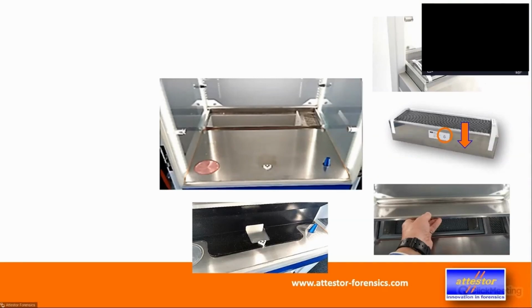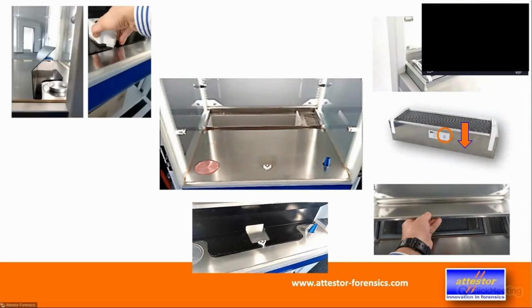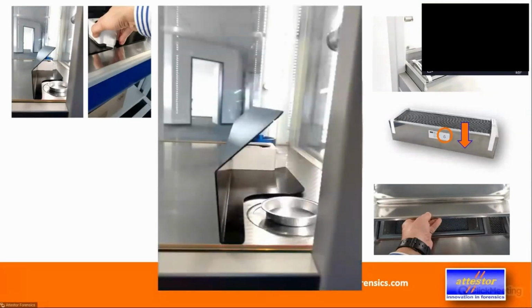But on the picture, stainless steel on stainless steel is very bad contrast, so you hardly see anything. So what you see now in black would actually also be stainless steel. In the front, you first put a baffle there, and then you fix it with the actual fan unit. And from the side, it looks like this.